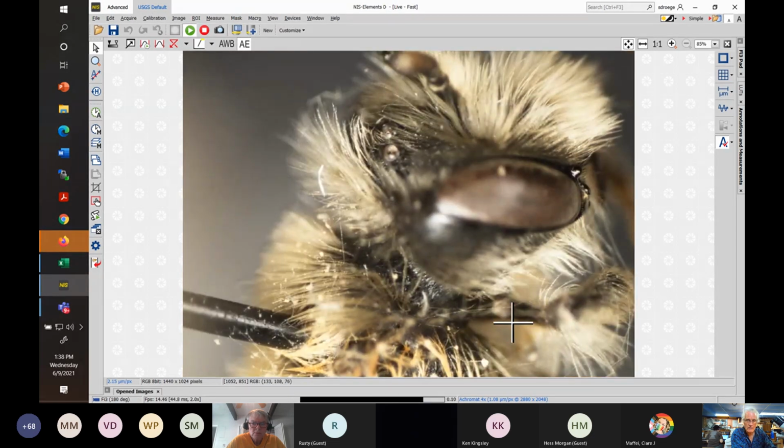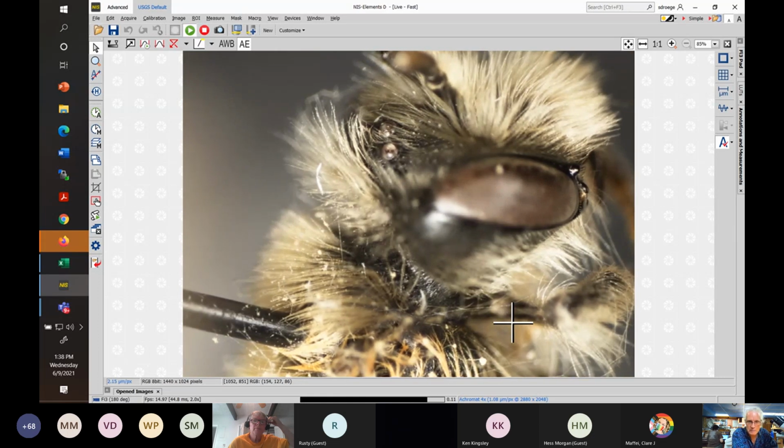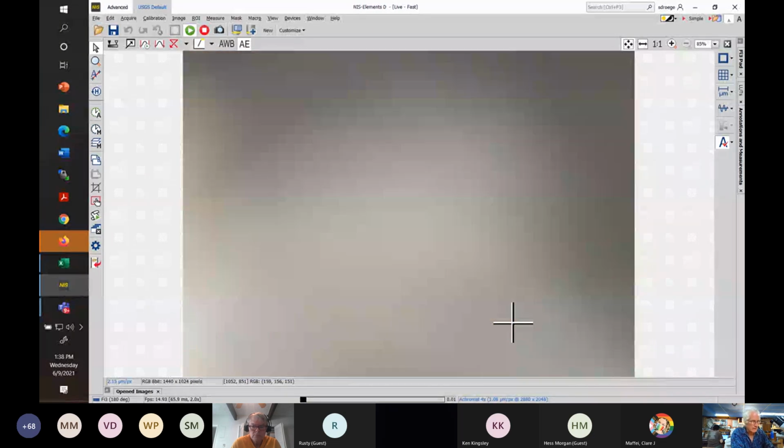very tricky for the people starting. Let's see if I can get a good, this is a very dirty specimen, but this is the problem. Like this, the pronotal collar was, I should break its head off. Maybe I will. You can also show how to shave.